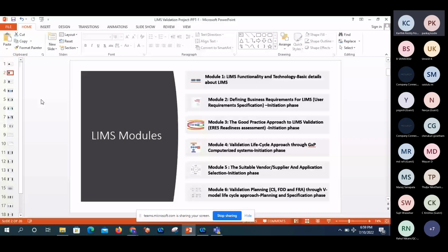No, partial only. Say, for example, in the first 6 months you did some of the validation and delivered it to the end user, right? In the 7th month you are going to add one more module, right?